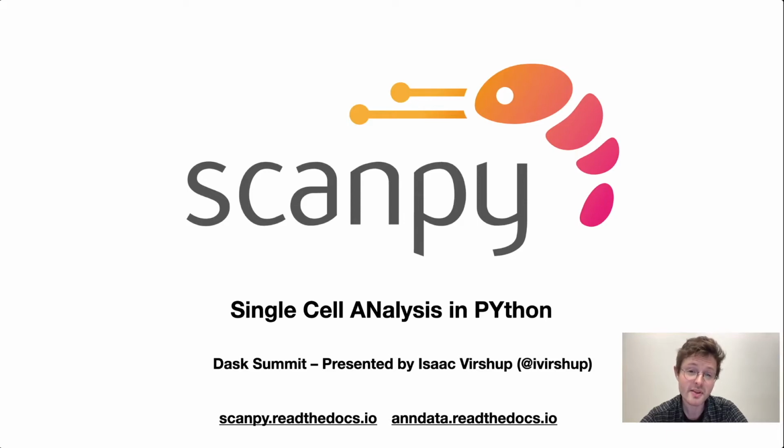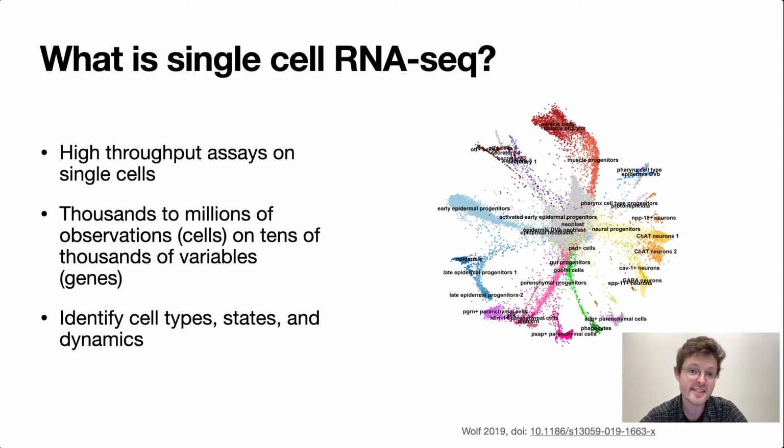I'm going to talk a bit about the data that I work with, about the project itself, and then how this relates to Dask. So single-cell data is any data that's collected on individual cells. One of the more popular kinds of single-cell data is single-cell RNA sequencing data, or scRNA-seq. This allows us to look at which genes are being expressed in each cell.